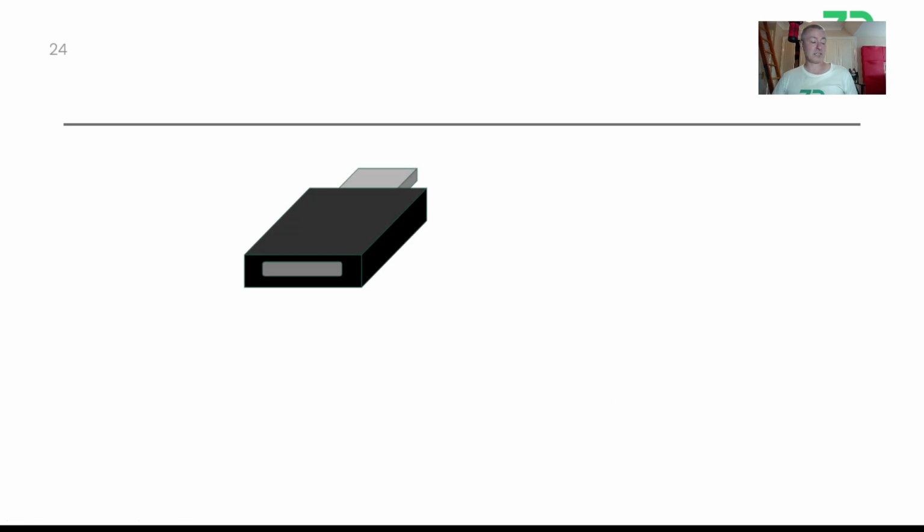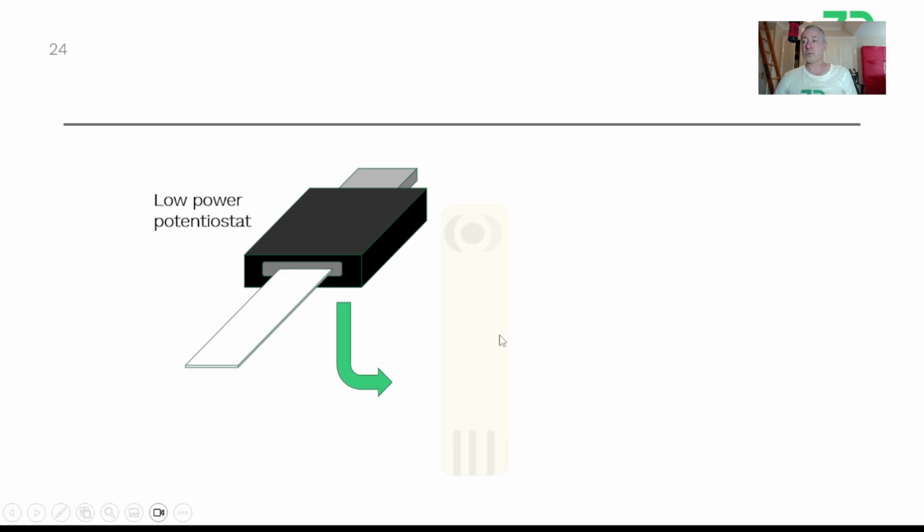As I say, this has become more apparent of late, because people are having these small USB-C driven potentiostats. They're nice and low power, they're very elegant, and they really aid you in visualizing how you can form a product. But in reality, they then lead to some non-linearities in your signals versus concentration because they're too low power and you become compliance voltage limited. The screen printed electrodes are often not helping in this scenario.